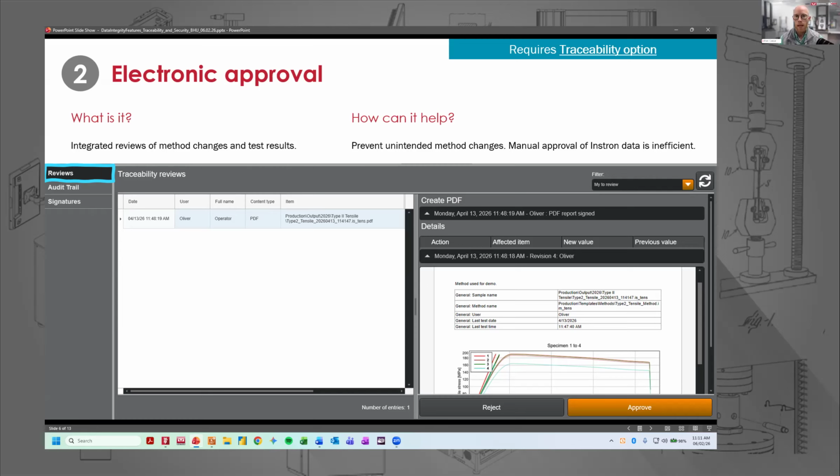And then all of a sudden, 3 or 4 weeks could go by of you using a method that was modified that hadn't been reviewed when that change was made. And there are just discrepancies in data. You might realize that the last few weeks or months of tests were done incorrectly, and that's a story that we hear repeatedly getting reported back to our team.